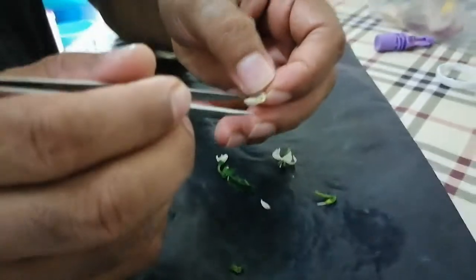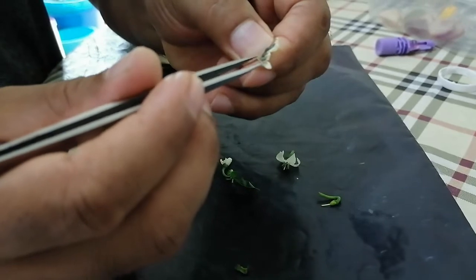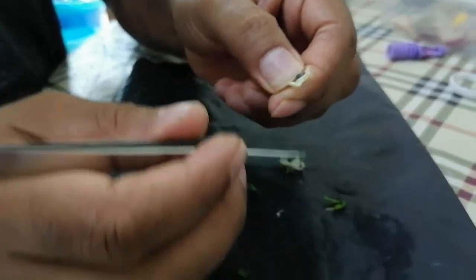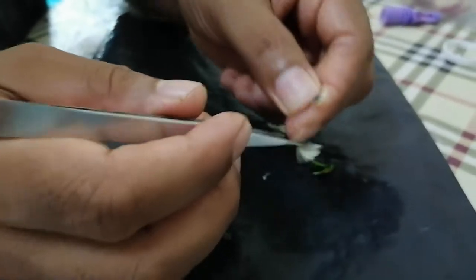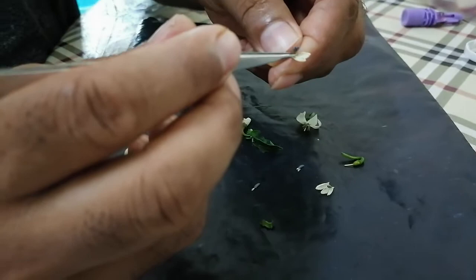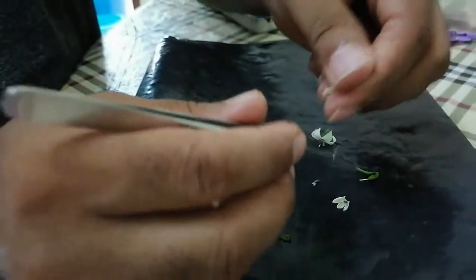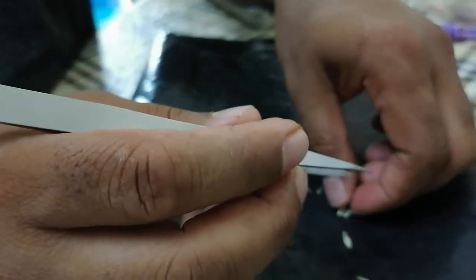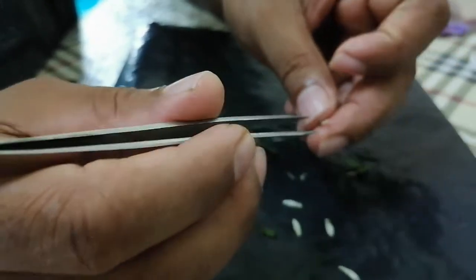Now I want to show you the anther and the petals together. You can see five anthers here: one, two, three — these three are here — and then two more. All together five anthers, and it is five petals as well.